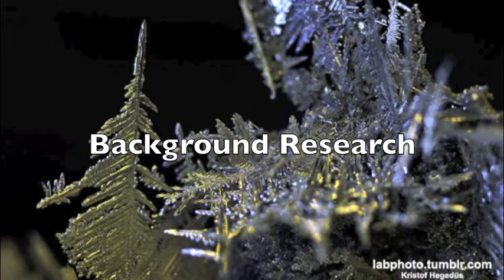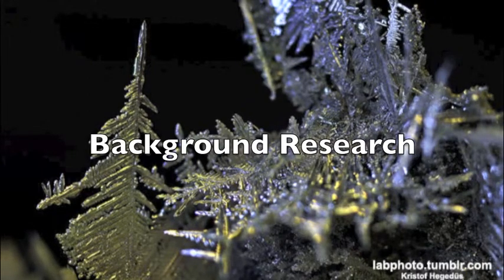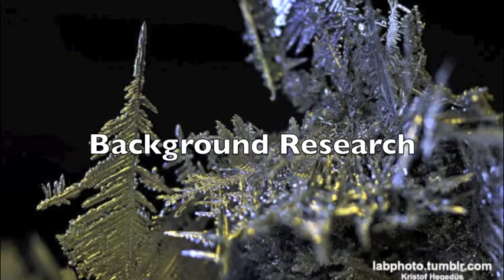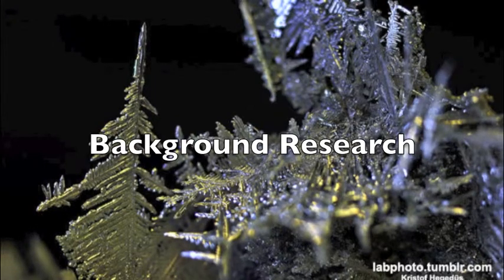The purpose of this experiment was to find the quantitative relation with copper, silver, and nitrate. Also to produce silver crystals from copper and silver nitrate. So the hypothesis for the experiment was as follows. If copper reacts with silver nitrate, then silver crystals would be produced.